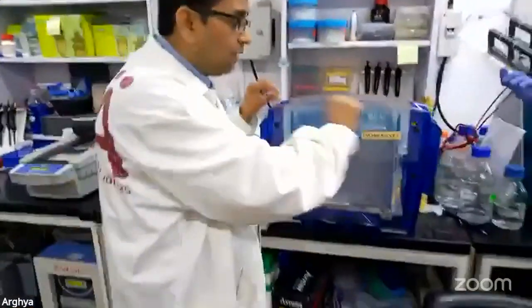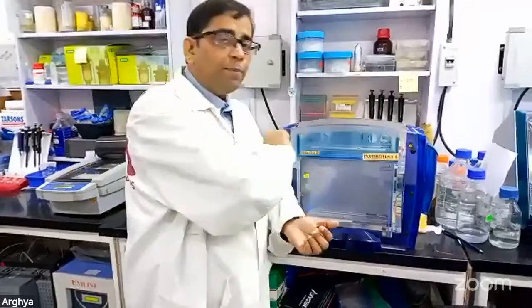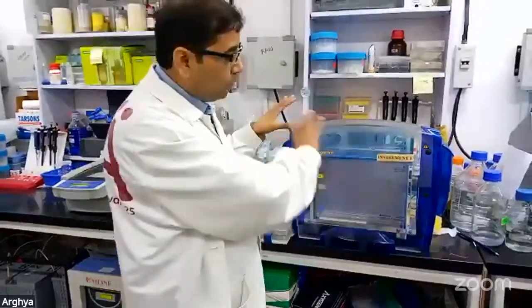So now think about you have 24 centimeter long strips from 3 control samples and 3 treated samples, and you are going to separate them simultaneously in the second dimension using this big unit. That's where I think this setup becomes very attractive, because you are reducing the gel to gel variability and separating a very complex proteome. On this kind of IPG strip, you can easily load even more than 1 milligram of protein, which is sufficient for looking at thousands of proteins on the gel. And you can separate those on this gel.